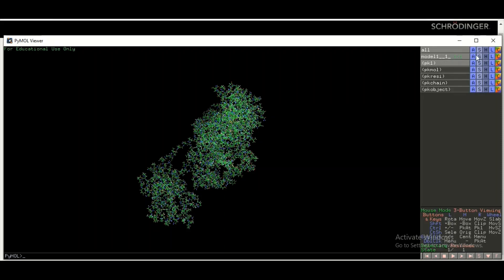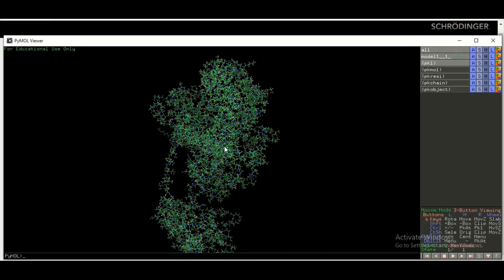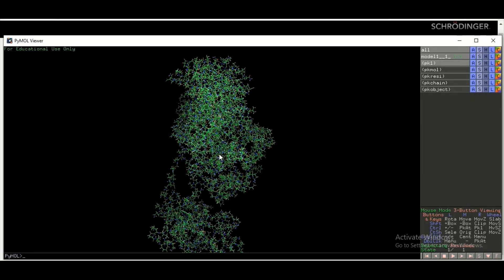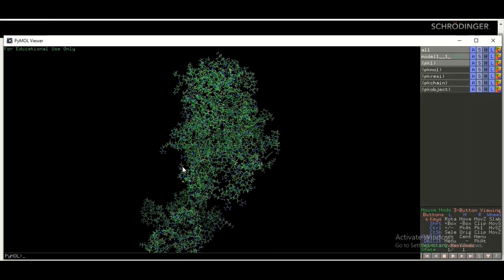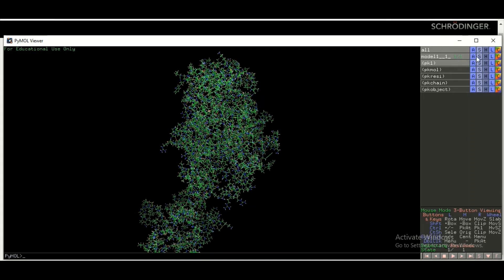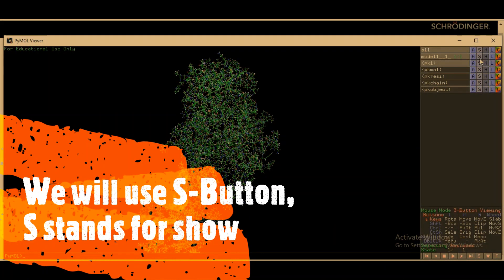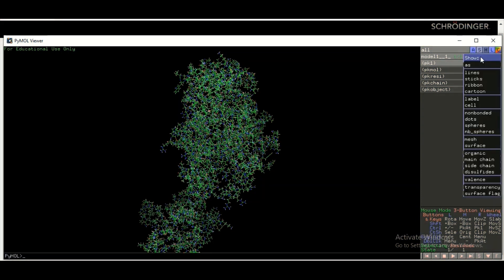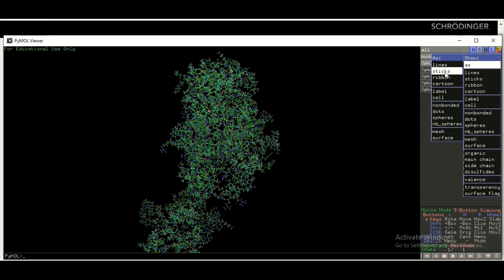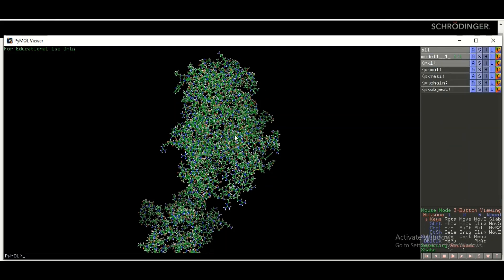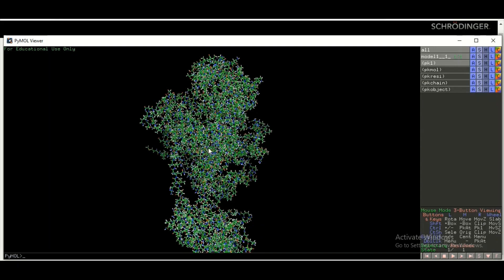You can also change the appearance of your three-dimensional structure from the wire format to other standard formats. To change the representation, click the right-hand side buttons. There are buttons labeled A, S, H, L, and C. Right now we are going to use the S button, which represents Show. Click S, then Show, then Sticks. The representation will change from wire or line format to the sticks format.